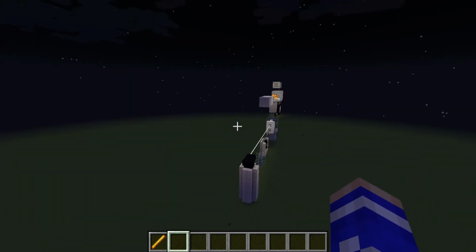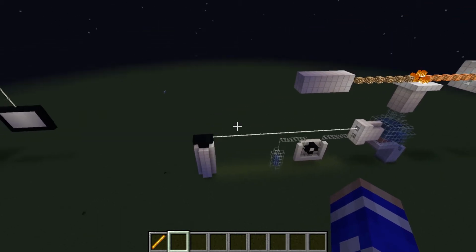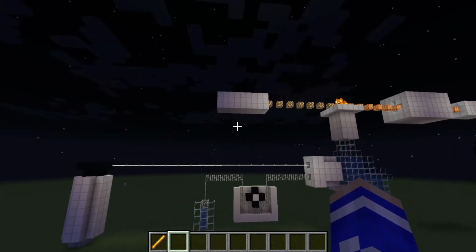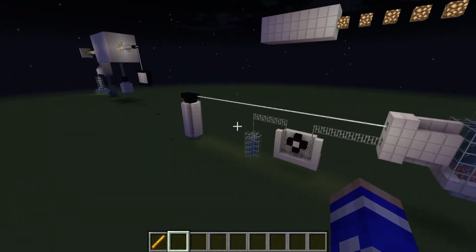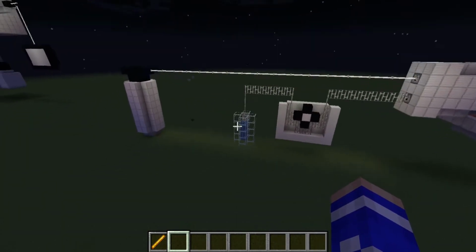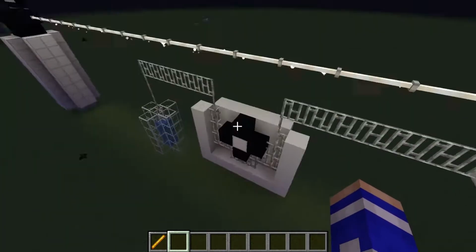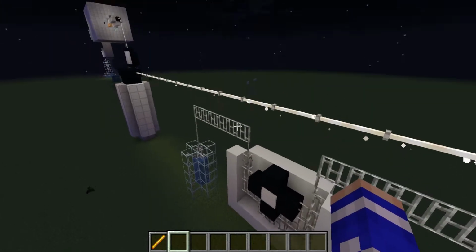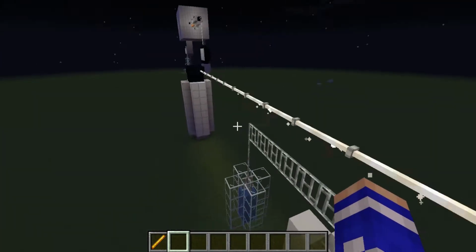The next one we're going to look at is ICP OES. So this is our emission spectroscopy, and that stands for inductively coupled plasma optical emission spectroscopy. So in terms of how the sample is introduced, it's pretty similar. We have our sample tube here. It's going to go through a pump system, which is a little bit different, but it's basically the same. It's just trying to get it into our nebulizer.